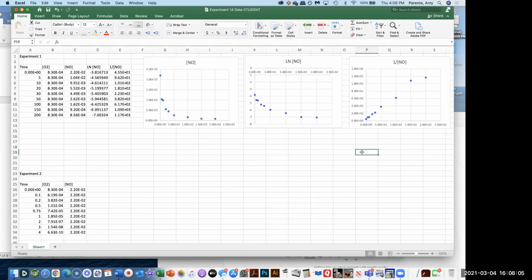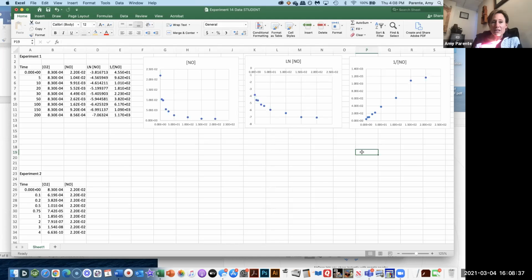Wait. So are you at least getting the time one? Yeah, I can get the time one. I can highlight the time. So highlight the time, then hold down control and highlight NO. Make sure you're holding it down before you start the highlighting process. Otherwise, it could just be a matter of timing. But it just highlights it clear, like it doesn't. Oh, okay, it did it. So now I insert a graph. So we want to make sure it's a scatter plot.